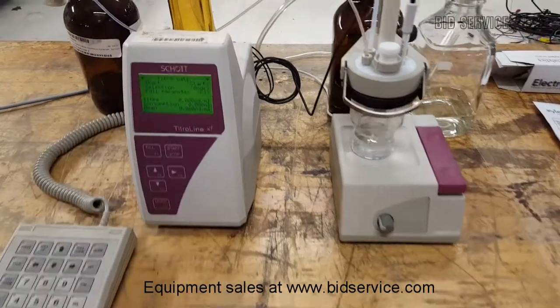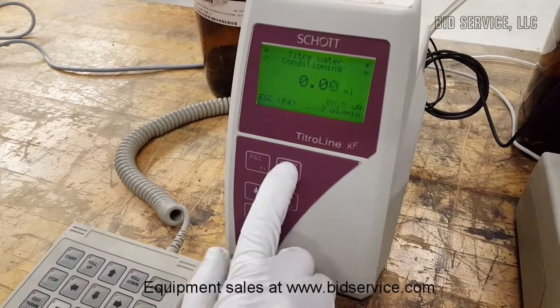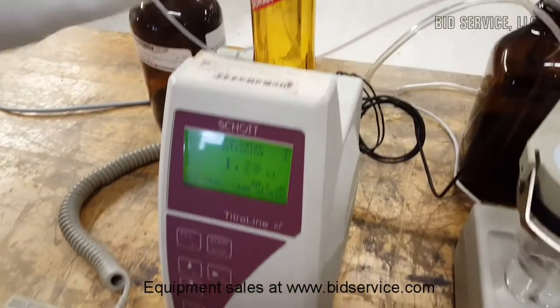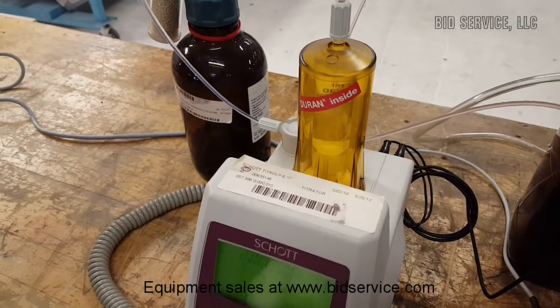So this is the titer water example. We'll go ahead and hit start — let's use this button here. As you can see, it's measuring the amount of liquid going through the Duran glass vessel. And you can see that the probe is reading some kind of current.